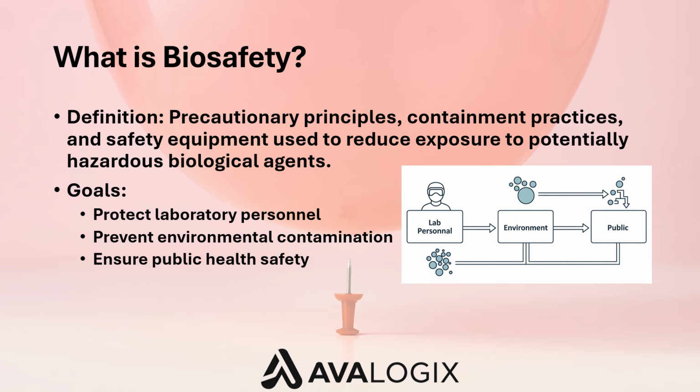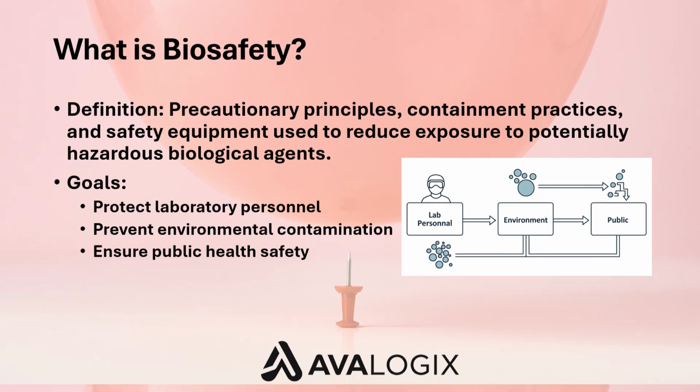Now think about the layers of defense. First, there's the proper handling of biological materials. This includes training, standard operating procedures, and use of appropriate PPE. Then we have containment equipment such as biosafety cabinets and autoclaves, and finally, the physical infrastructure, walls, doors, ventilation, and so on. All of these elements work together to create a safe working environment. Without biosafety, even a minor mistake could result in a significant public health issue.